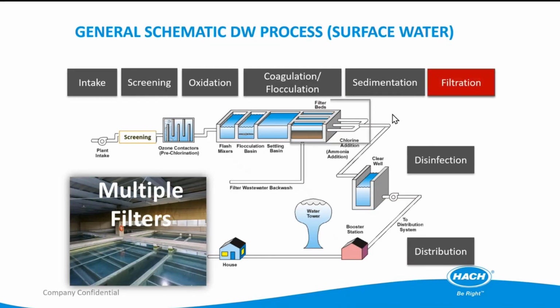Next, we'll go through filtration. Normally for filtration we use a sand filter, but now we also have another option, the upflow filter. I also see that in Vietnam. Maybe in Philippines we also already use that upflow filter. So after the filtration, we will need to measure turbidity.